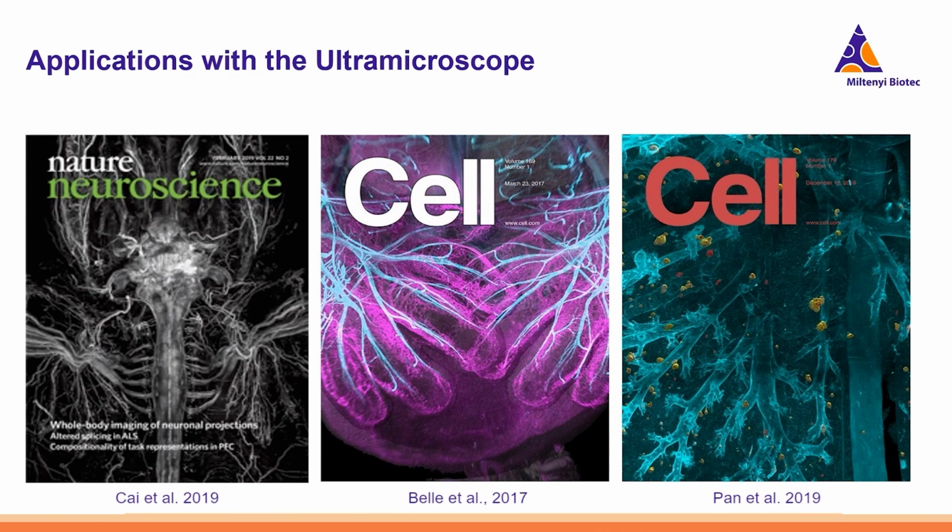We are now moving into the last portion of my talk where I will review some neuroscience-based applications using the ultramicroscope, but of course there's potential for much more than what I will show you here. I hope that you feel free to reach out to me. I'll provide my contact information at the end of this presentation, or you can join us at the booth afterwards if you want to discuss ways of enhancing your research projects by incorporating light sheet microscopy.